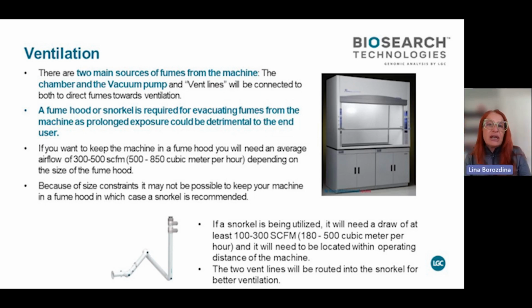It's a pretty smelly chemistry. For us chemists, the smell of pyridine in the morning is actually delightful, but your office folks are going to think something died when they smell it. So you want to be considerate to your colleagues who do not work in the chemistry lab. Ventilation is important.